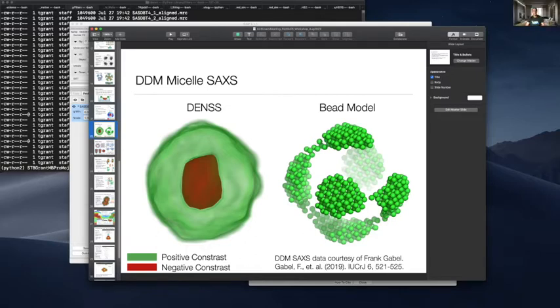Yeah, I think what happens, of course, is that when we do apply a P of R function, we're already applying some kind of human-based filtering. It has this Dmax. We're getting rid of noise, defining a Dmax, etc. Right?